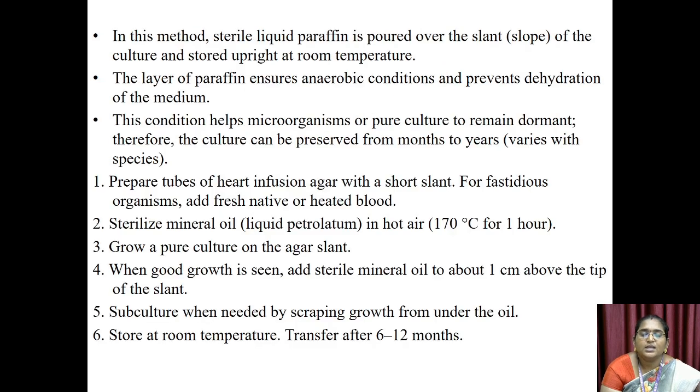In this method, sterile liquid paraffin is poured over the slant of the culture and stored upright at room temperature. The layer of paraffin ensures anaerobic conditions and prevents dehydration of the medium. This condition helps microorganisms or pure culture to remain dormant. Therefore, the culture can be preserved from months to years.